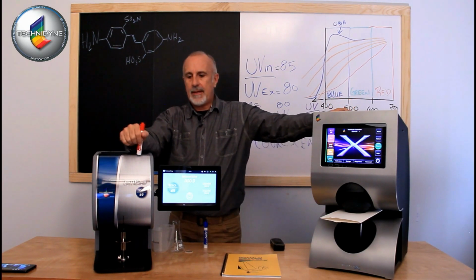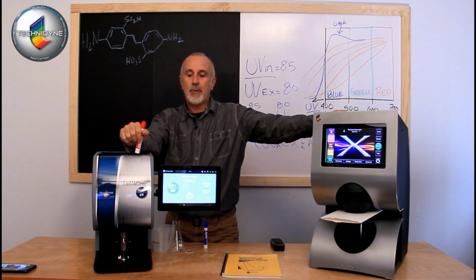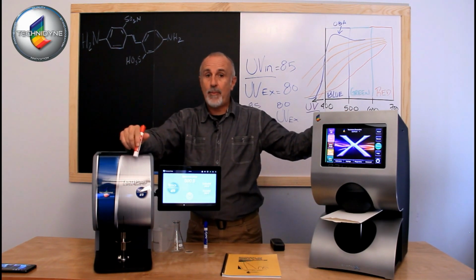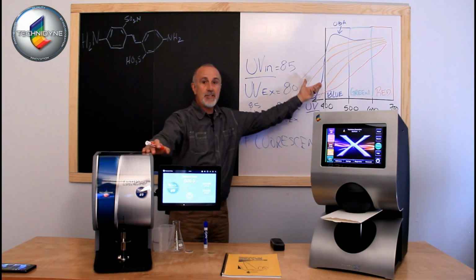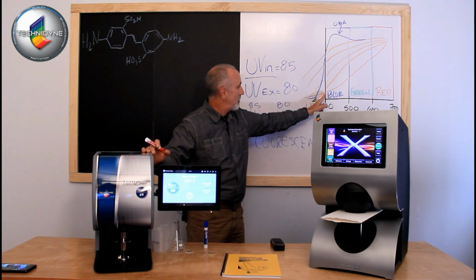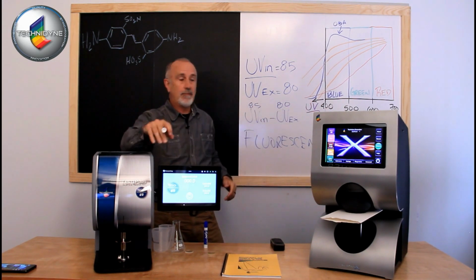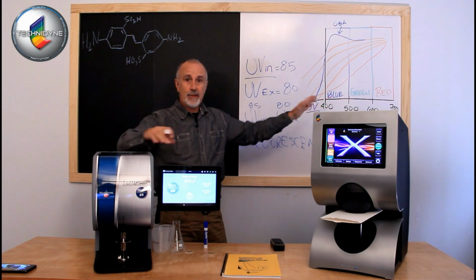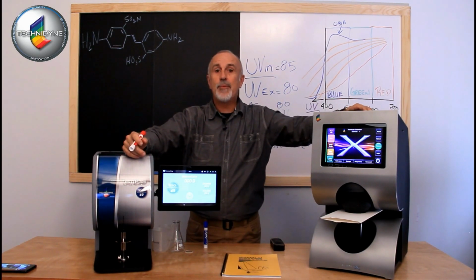So the original setup of these guys for measuring the effect of an optical brightener was actually pretty accurate to what the indoor viewing environment would be. So you would basically illuminate it, UV included would be this QTH energy. Okay, so you've got this energy over here in the UV region of the spectrum. So you can see it's a low level of energy. You make that measurement. You put that cutoff filter in, get the UV excluded reading, and you get your fluorescent component. It was really simple the way that did that.